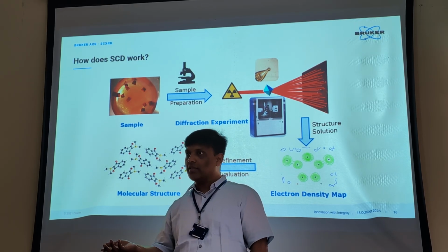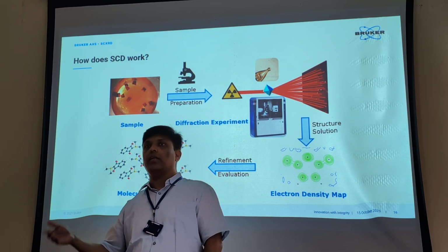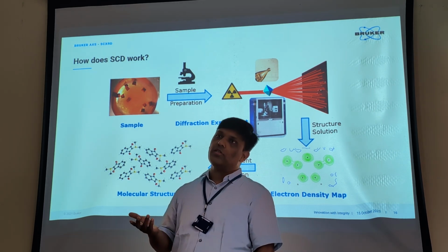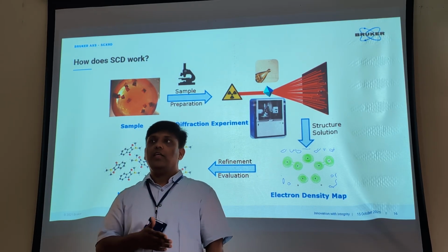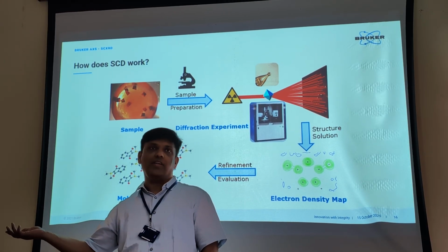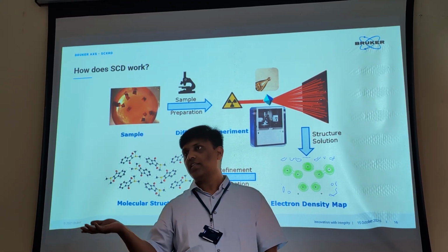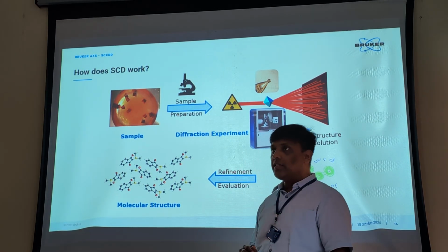Okay, so everything matters. And then there is also the sublimation method, the sitting drop method, and the hanging drop method. So there are plenty of methods to obtain single crystals. Protein people generally use robots to set up crystallization, because it's not easy to get protein crystals. They put up several thousands of trials with different molar concentrations to get some crystals. Because if you have a crystal, then you can arrive at the structure in no time. So you get a single crystal like this.